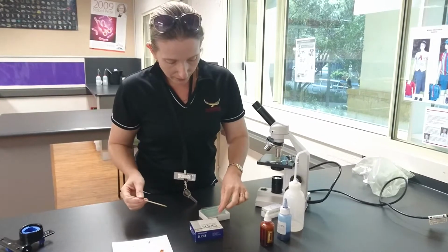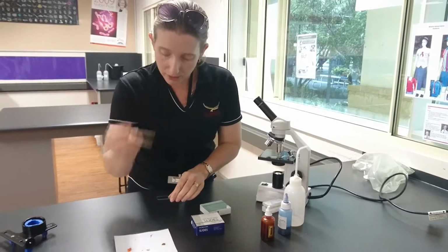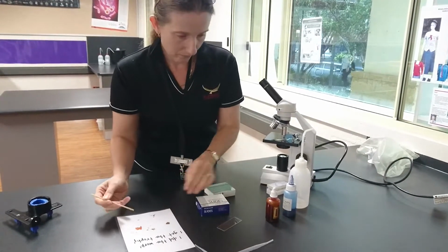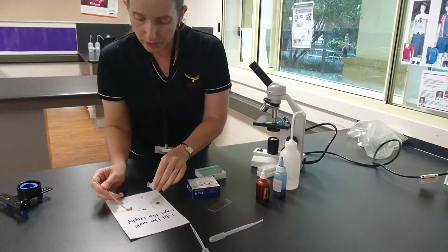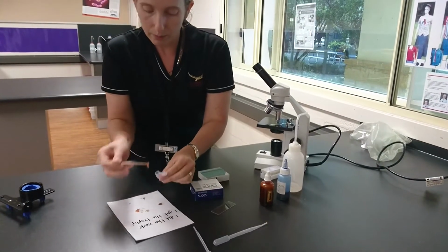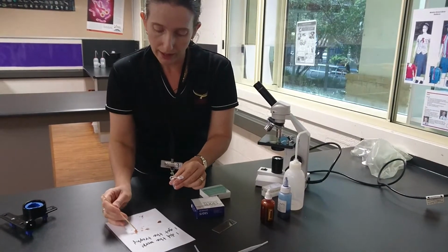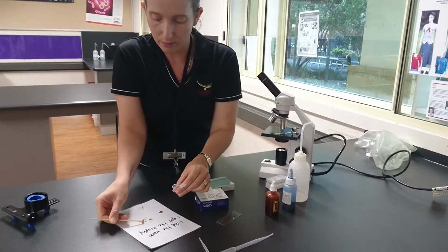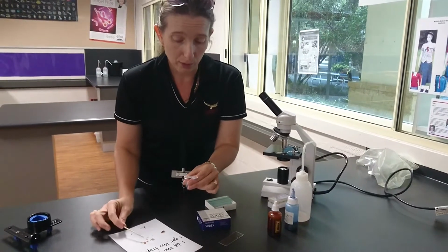Now, very first thing you have to do, take out your slide and use your little stick here to get a sample. And the very first thing we do, we're going to reduce the volume down by putting it into one of these little tubes here and getting some water in with it, just to spread the cells out, because you see, if you have too many cells at once, you actually can't see the cells very well.